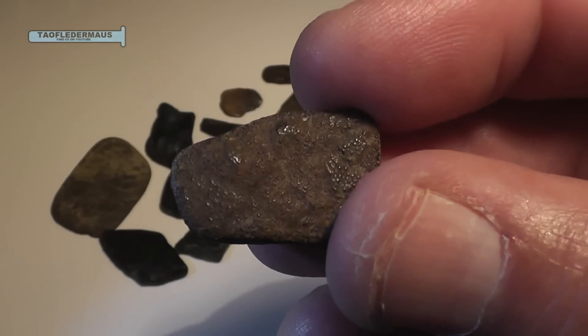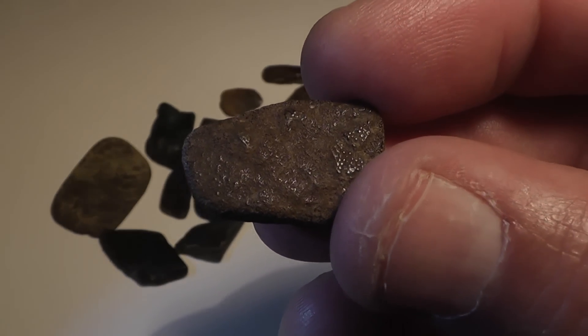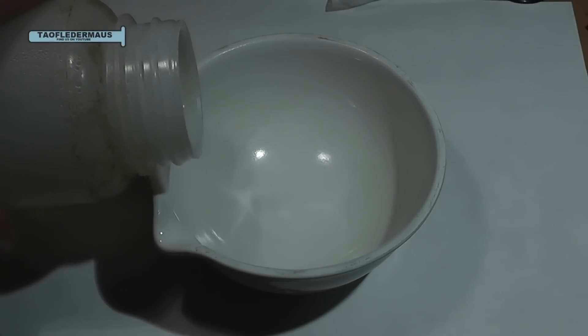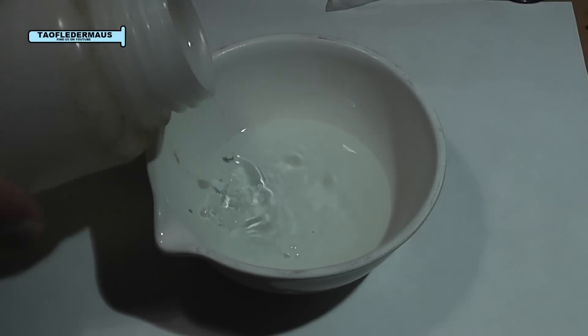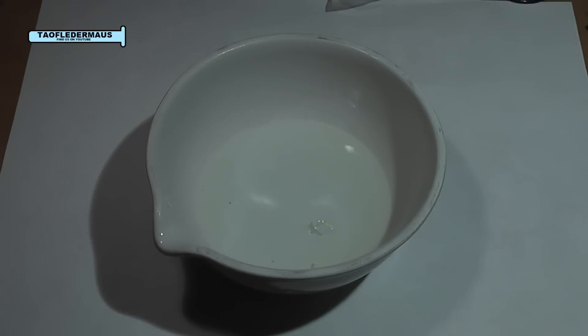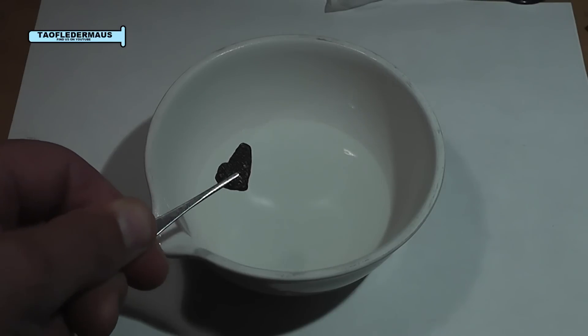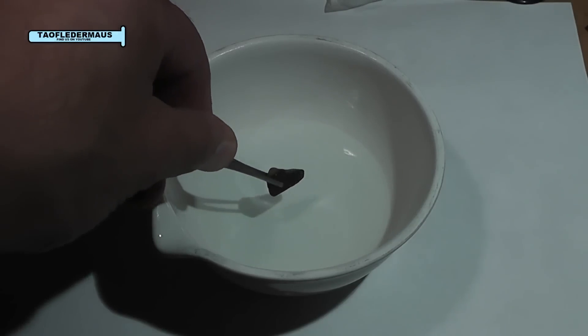So we're going to take one of these today and put it in some acid. Today we'll be using a somewhat weak solution of nitric acid, probably about 20% concentration. Now I probably should have been wearing gloves because we're working with acid, and I'm sure every science teacher out there is freaking out.